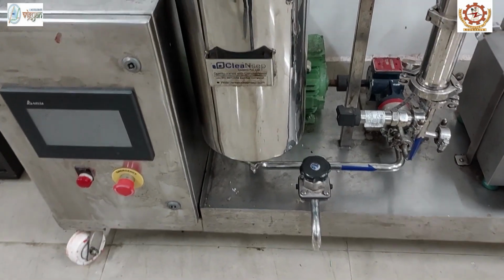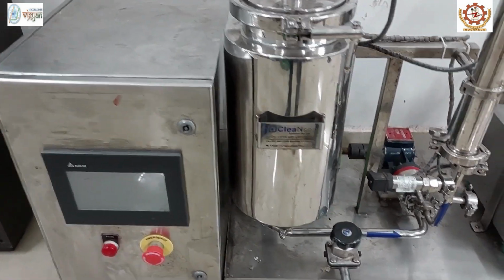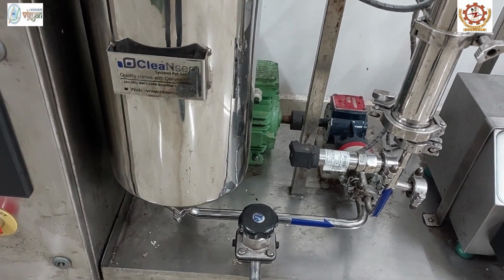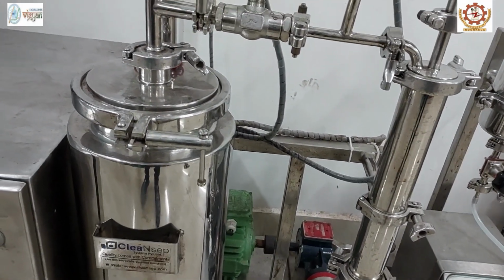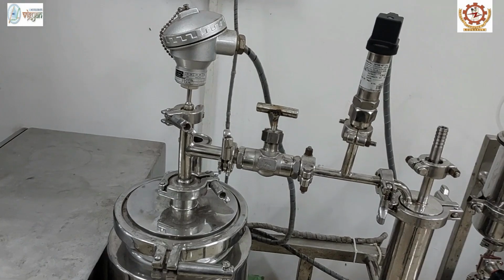Coming to reverse osmosis technique, it is also known as hyperfiltration. It consists of a dense membrane with a pore size less than 1 nanometer, an operating pressure of 2000 to 6500 kilopascal, and a molecular weight cutoff of 100 Dalton.